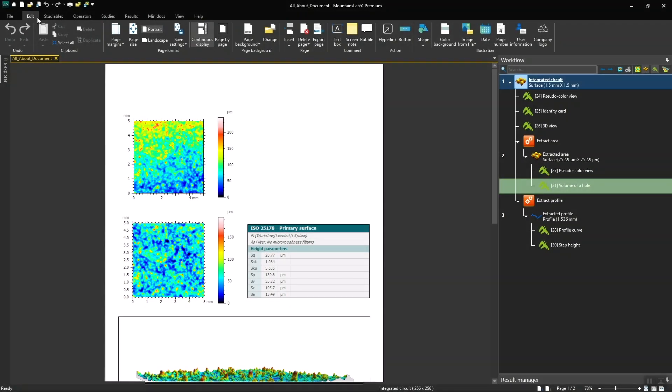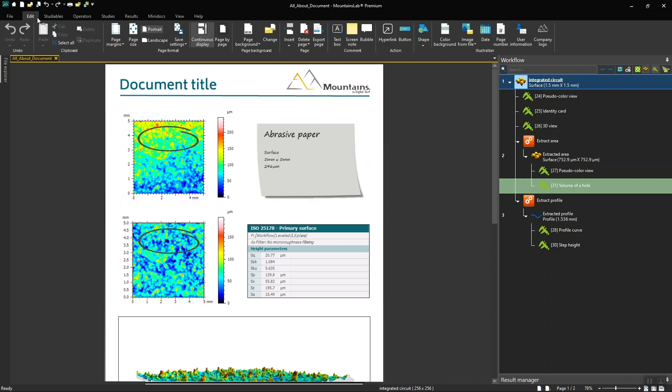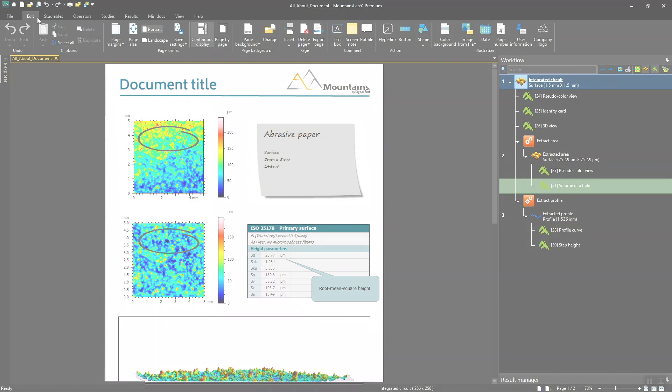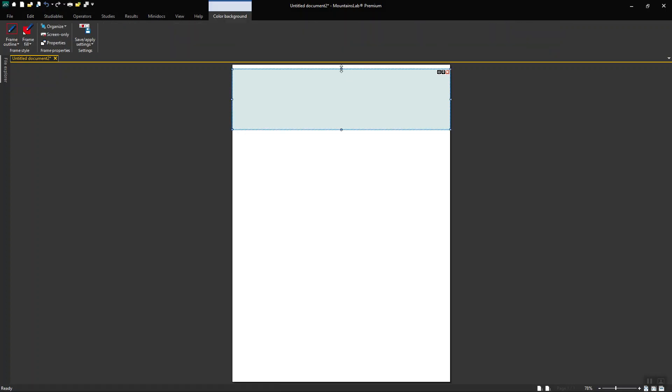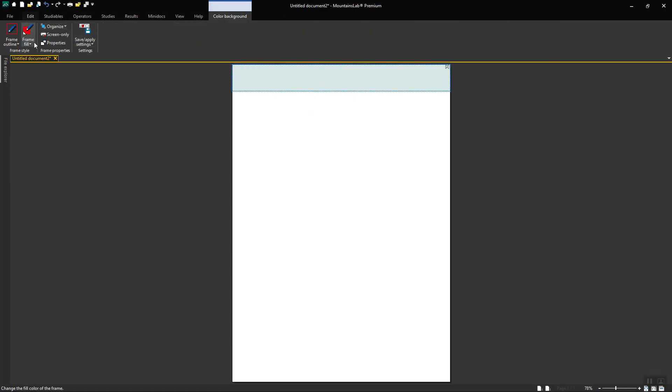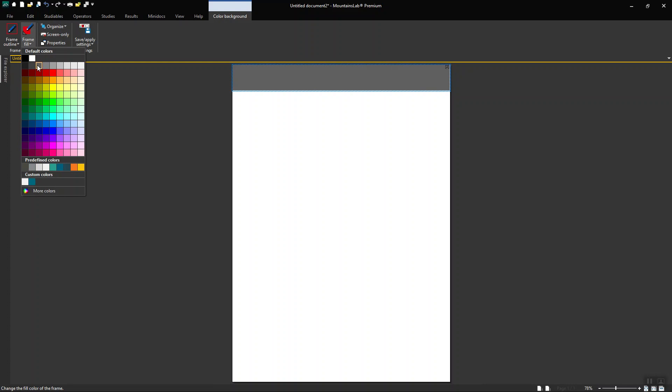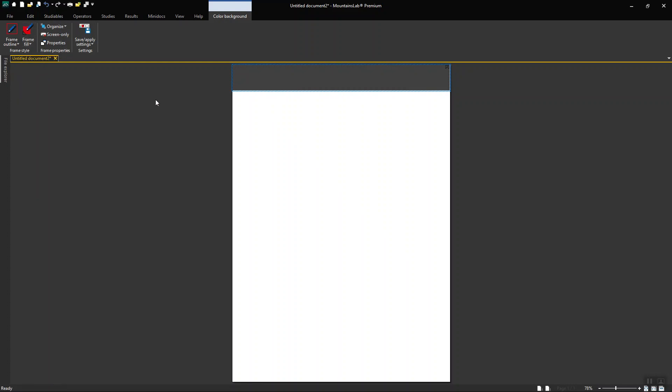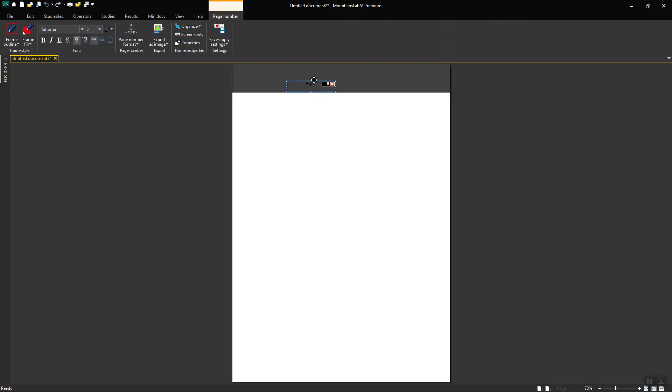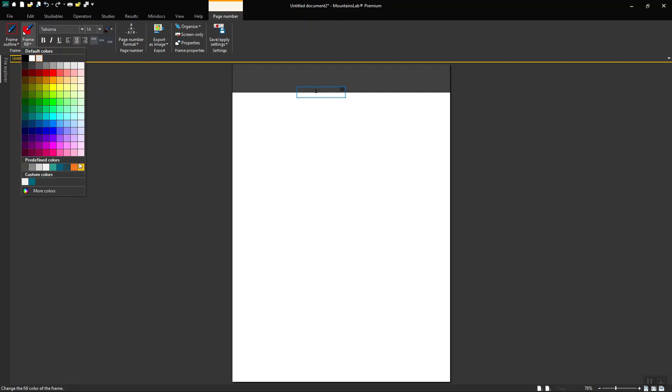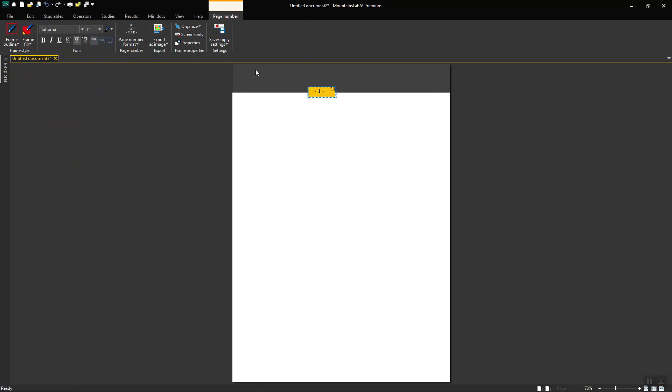You can customize a page with elements such as a title, a logo, or other illustrations. Let's create a page header using the Color Background tool. I can choose the size and position of this frame as well as its color. I can add page numbers and choose their format as well as font size and color.